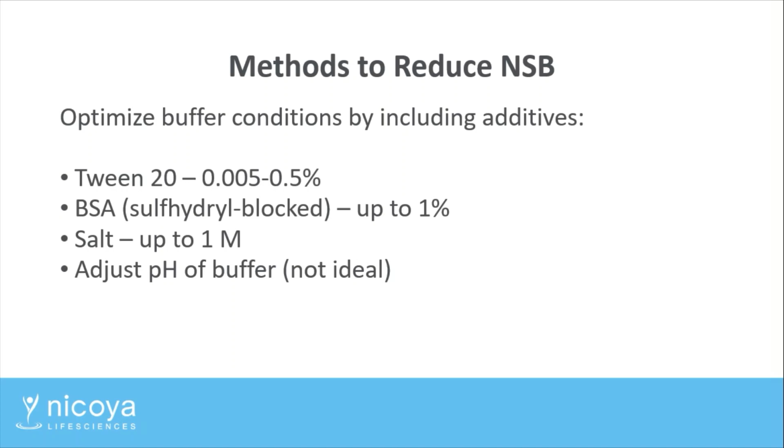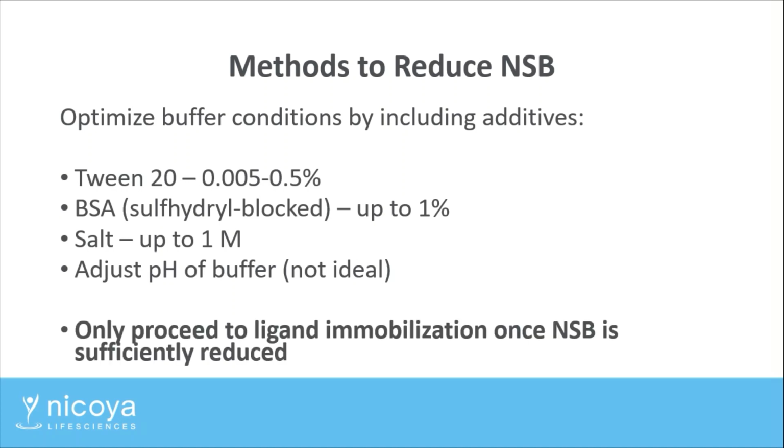The literature is a great resource for looking at starting buffer conditions. But note that the surface coating on sensors from different companies will vary, so we highly recommend testing specifically on our sensors. And ideally, you only want to proceed to your specific binding test once you have reduced the non-specific binding as much as possible.